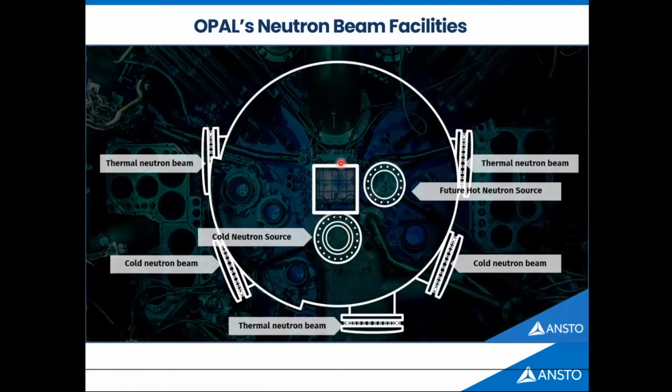So yeah, fine, we have a reactor. Somehow we have to get neutrons, and I have to get some instrument on this place. So what is actually giving us neutrons? We have thermal neutron ports for things like diffraction and single crystal. We have cold neutrons. We have another thermal port, and another cold and thermal. The arrangement is a design property which attempts to give as many neutrons out of the reactor as possible, considering also spatial distribution. If you have a cold source sitting somewhere inside, there are only certain places you can get the cold neutrons out, and so on.